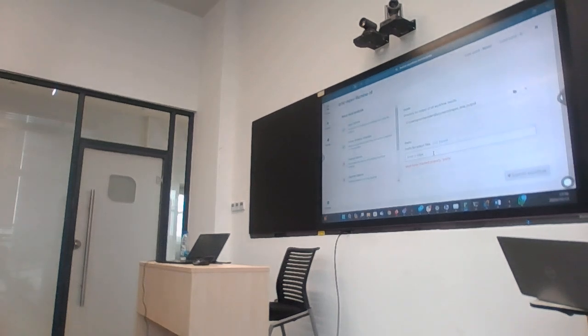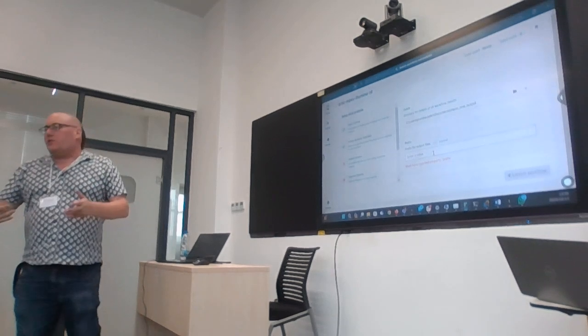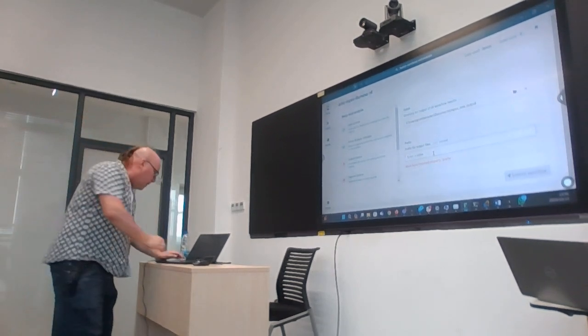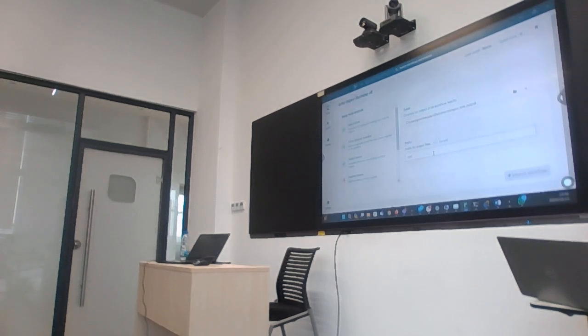Okay. Push on, step. Push that down. Okay. You need a name for your output file prefix. It can be anything. I'm just going to call mine 1. So just put anything in that field there. On your side, I want to see what your output screen looks like.